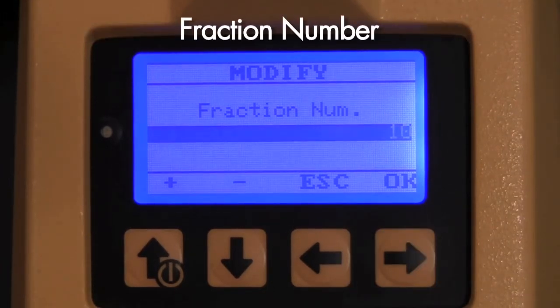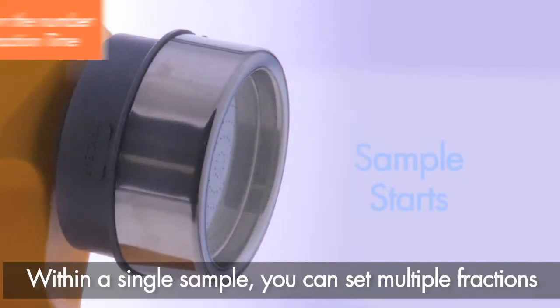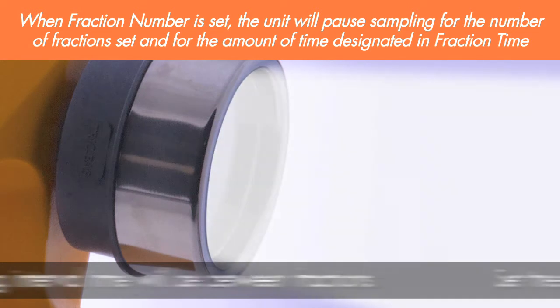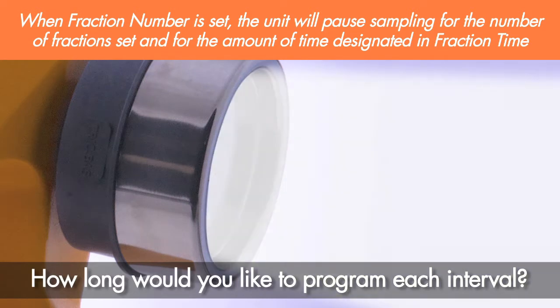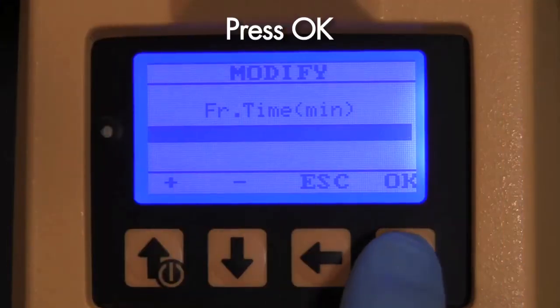The display window now shows fraction number. Within a single sample, you can set multiple fractions and select how long the interval time will be between fractions. Set the number of fractions you desire within your programmed sample time. Next, select how long you would like to program each interval — from 1 to 60 minutes — then press OK.